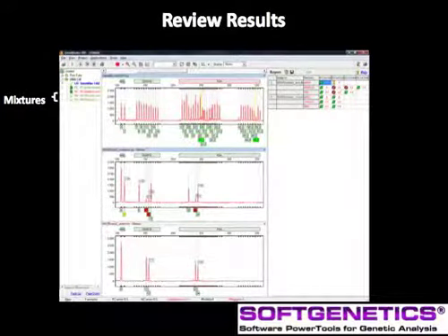Analysis is rapid, generally processing 96 samples in approximately 20 seconds. In the file name tree at the upper left, we see that the last 2 files are consistent with the parameters for mixtures set in the third screen of the Run Wizard and are indicated with MX: and olive green font. The allelic ladder has a few virtual alleles with higher than expected RFU, as indicated by green allele labels and yellow vertical bars. The electropherogram and allele report table for the MX Case 2 evidence file has red flagged alleles at the minor peaks.